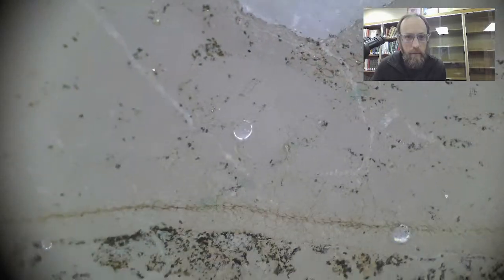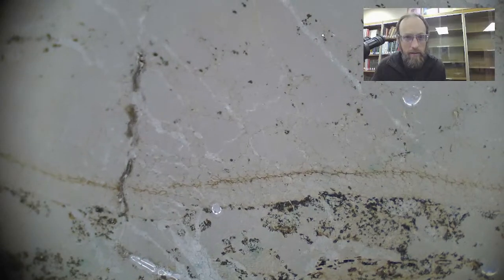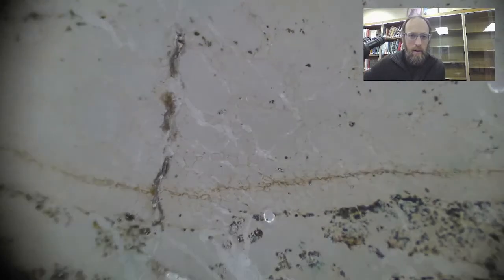That last one we were looking at, it seemed like there was a lot less color differentiation between cell wall and the rest of it.